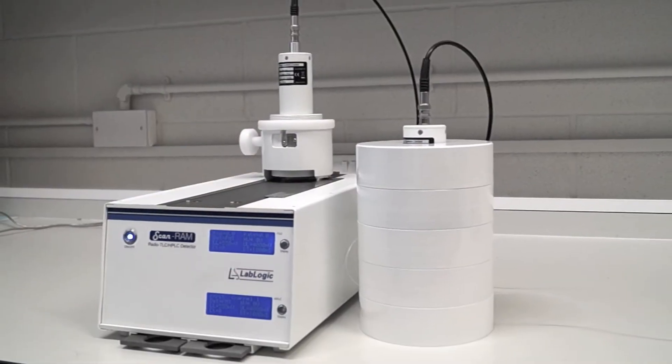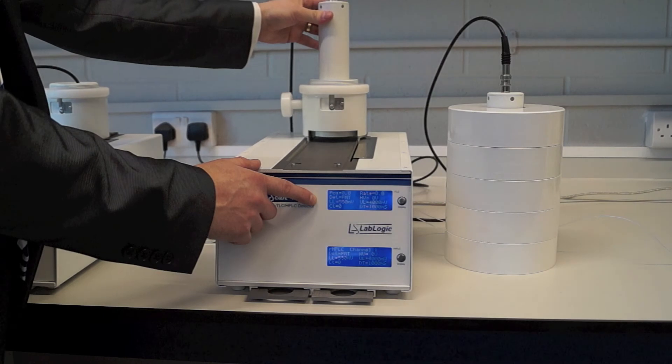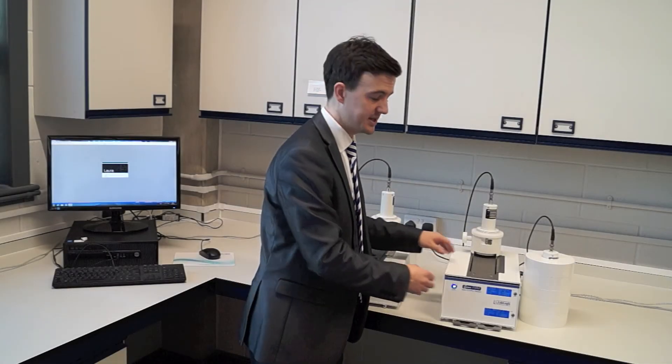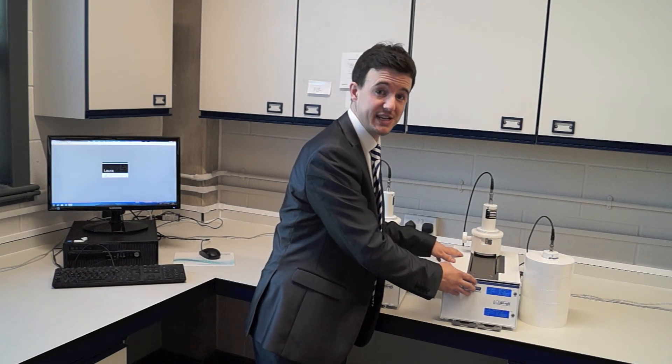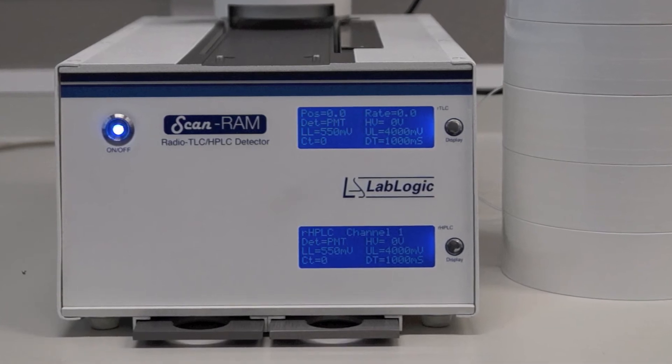Another product in the QC range is our new Scan-RAM system, which is a very unique solution combining two technologies in one compact unit: radio TLC and radio HPLC. One point to note is that the electronics for TLC and HPLC are totally separate from one another, which means that you can use both systems independently and simultaneously in the lab.